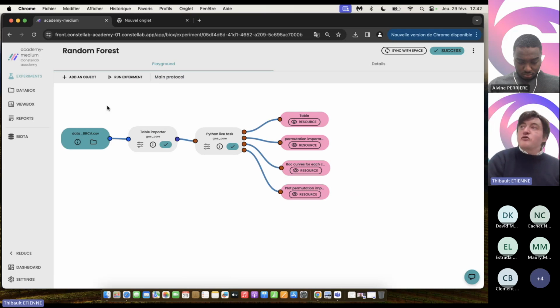Of course, we can use other types of algorithms. There are different algorithms to do that. For example, some algorithms linked to neural networks. In this webinar, we don't have time to explore other algorithms. I focus on random forest because it's very easy to understand and very powerful to manage large datasets.